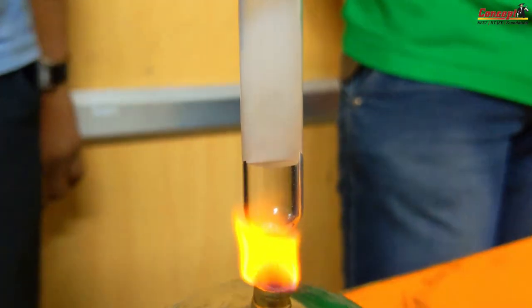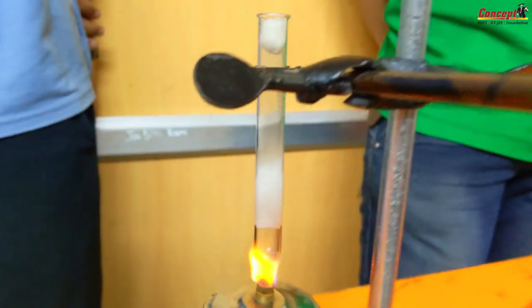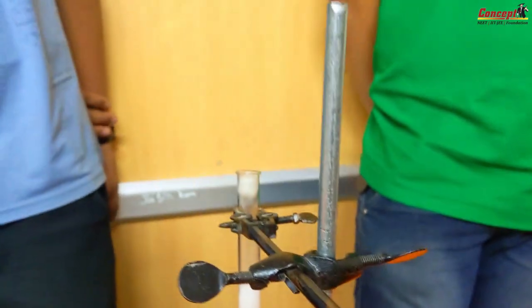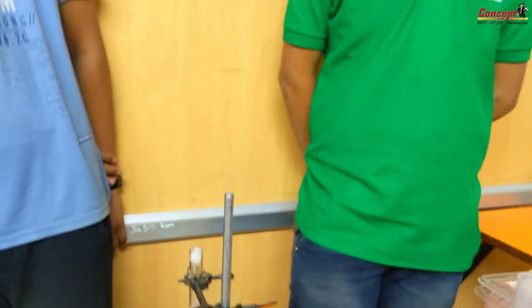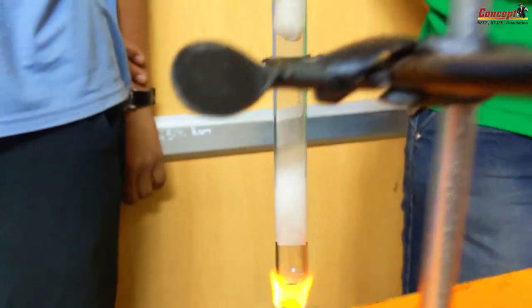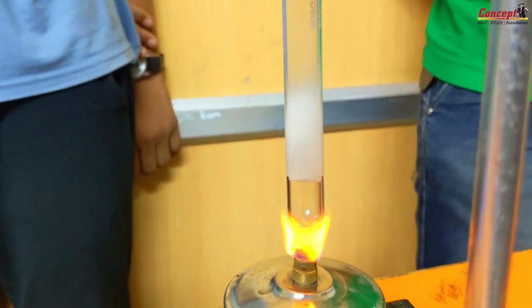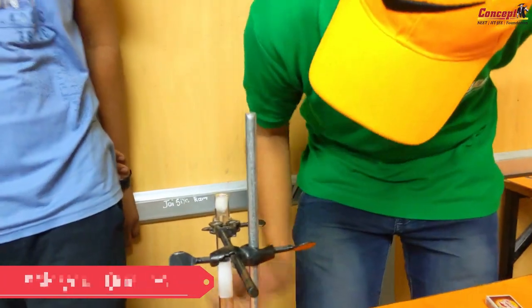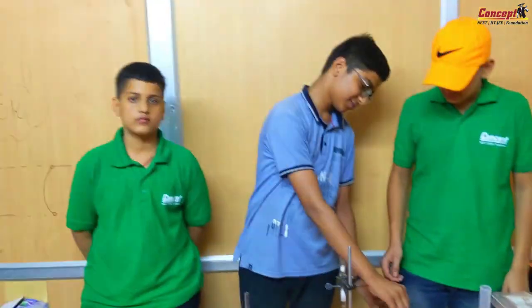Now almost all of the solid ammonium chloride has sublimated. What is this substance on the walls of the test tube? Do you see a white powder on the walls of the test tube? What is this substance? Ammonium chloride — it has again condensed back. Why? Because of the wet cotton. Excellent. Turn this off. A successful experiment performed by these three young students. Can we have a round of applause for them?